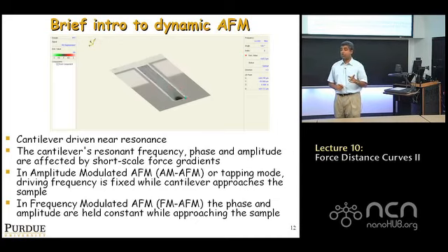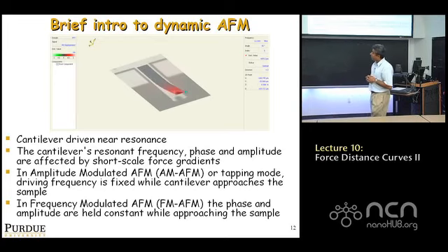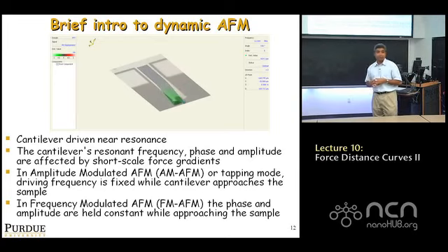It turns out it's described by something else, a combination of sines and sine hyperbolics and things. Although on the face of it, it looks just like you apply it this way, in reality, it's actually more complicated. But what ends up happening when you do dynamic AFM is that there are many modes. You can have what are called amplitude modulated modes. You can have frequency modulated modes. There are also things called phase modulated modes, many different modes.